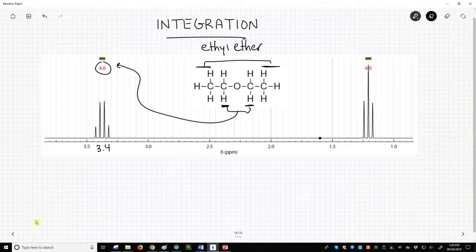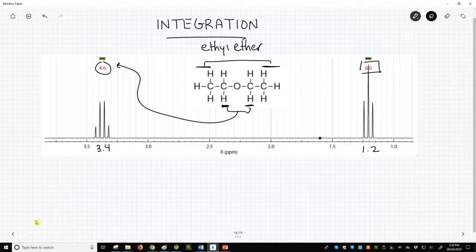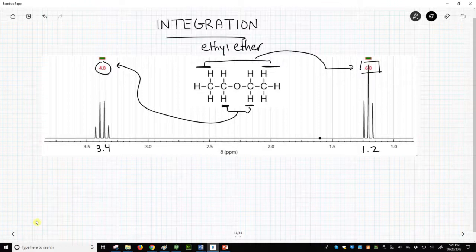The signal at around 1.2 ppm represents six hydrogens, shown as 6.0 above the peak. These are the six hydrogens from the CH3 groups. If we could accurately measure the area below these curves for the two peaks, we would find that the two areas have a ratio of 4 to 6, the same as the numbers over the peaks.